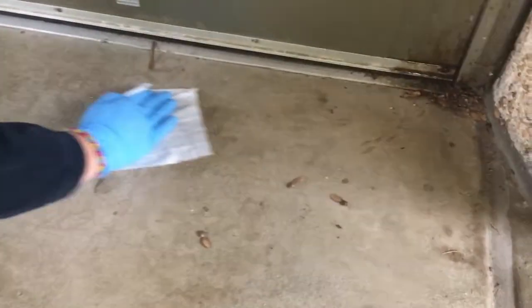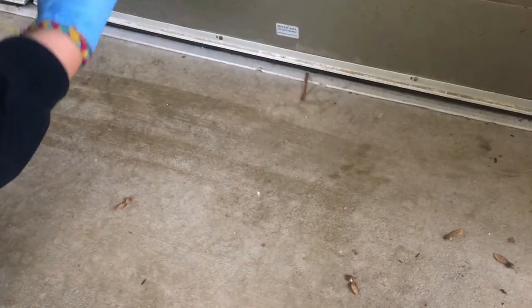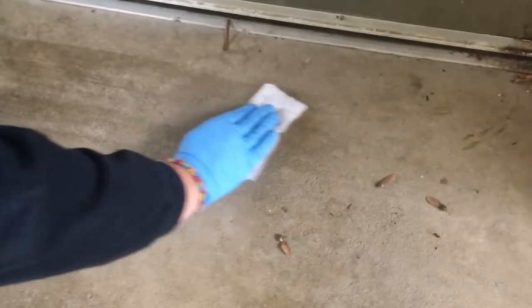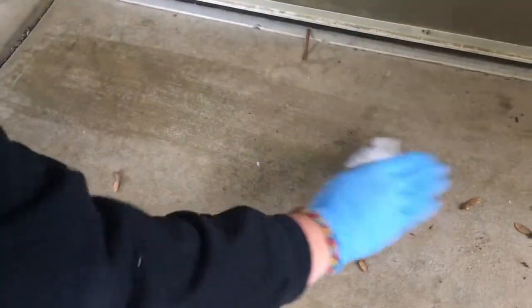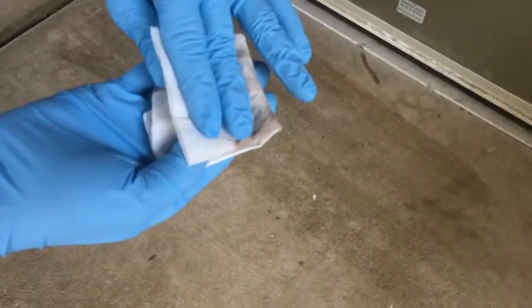We will swipe in front of the door, collecting as much dust as we can. Once you've collected dust visibly, fold the wipe over and go over the same place again. Fold the wipe one more time and wipe the area.